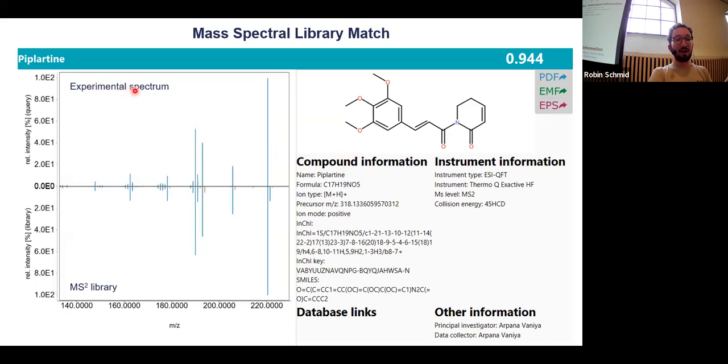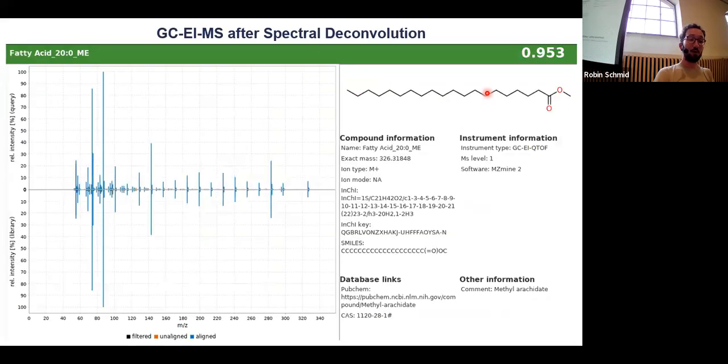And then on the top, we have experimental spectra, and usually in those mirror matches you see all the signals that are matched, and then the cosine similarity. There are also other scores being developed, and we have the developers here also, so MS2DeepScore, Spec2Vec. There are other scores that we might be seeing in the MZmine session later.